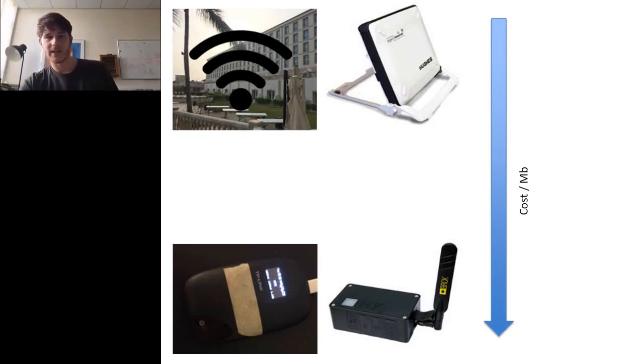So we needed to be able to upload this data, because at the time there was no such thing as a base caller that could run on the laptop you had with you. The only base caller available back at this time in 2015 was a cloud-based caller called Metrichor. So we needed an internet connection to be able to upload the data to the cloud-based caller.